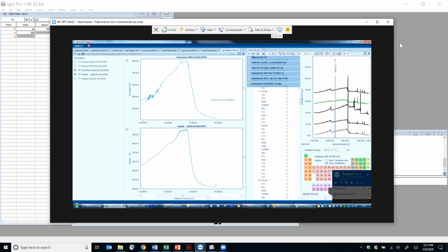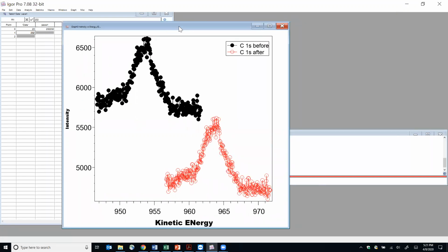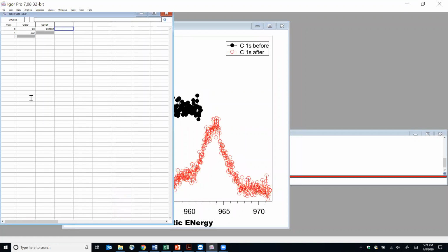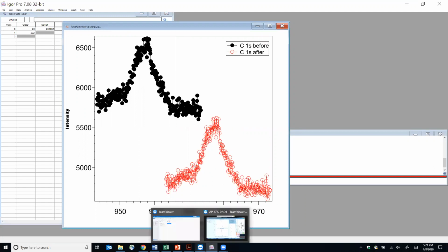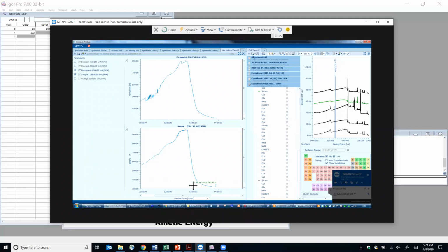When I send you this, you will have something similar to this. You can have X and Y for one plot, one Y in the other plot, then you do the same graph and you just need to append this trace to the graph. You will have a table, 4 columns. And actually the X column is the same for both, because I acquired those data at the same time. Yeah, you can see here, it's the same time, same X axis. Okay, sounds good.